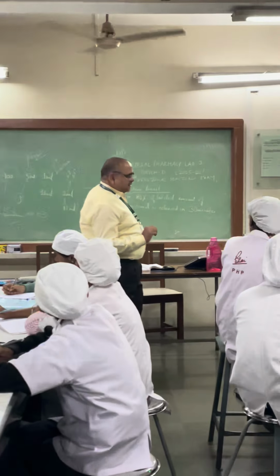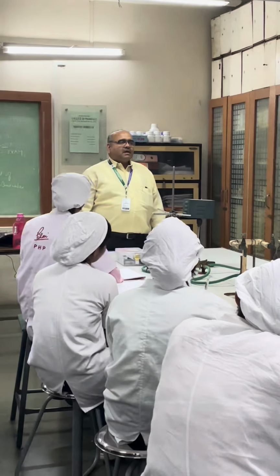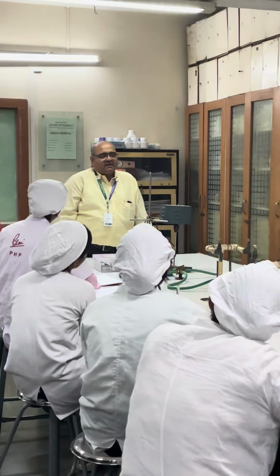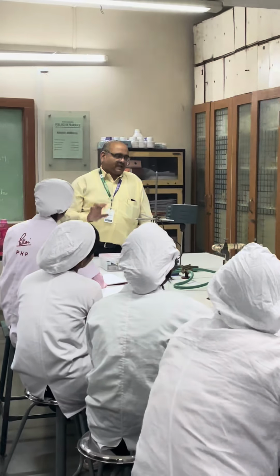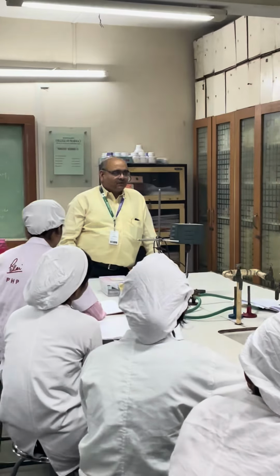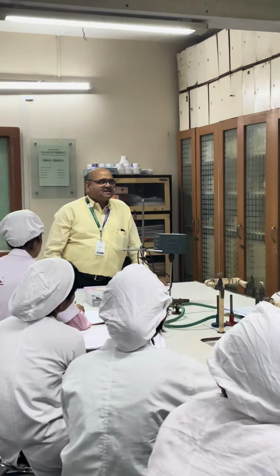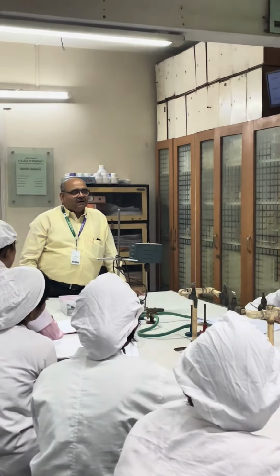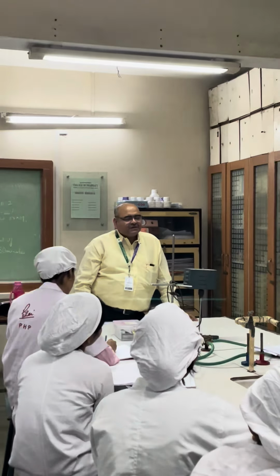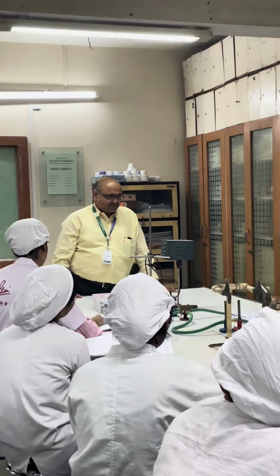See, just listen. To other batches, I have explained the remaining tests also. For your batch also, I will explain those tests. See, this is the presumptive test, where you will get an idea about the presumptive evidence of coliforms. Now, if in this test you get the result that the water is non-potable, or you get the idea about presumptive evidence of coliforms, then the examination will be continued by doing the confirmed test and completed test.